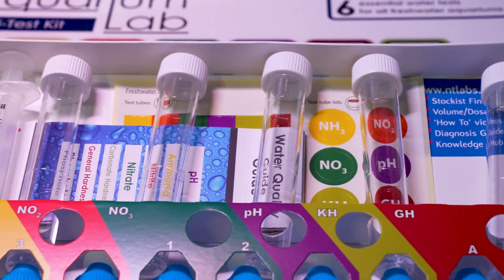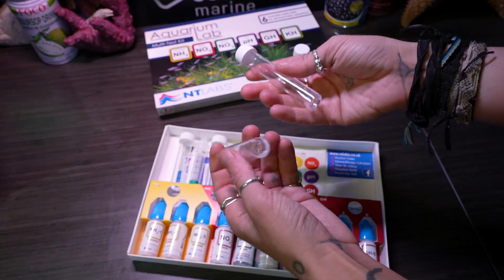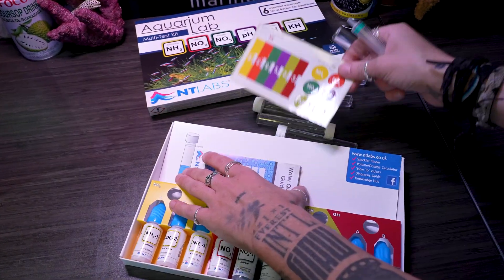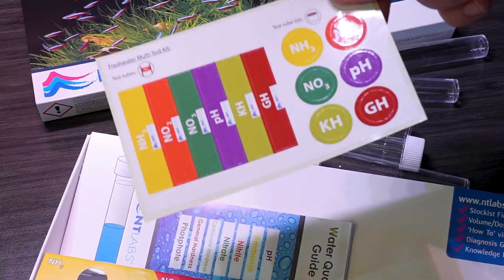Let's check out the test. Upon opening, you will see it has a pretty neat design. It includes test tubes, reagents, handy dandy stickers to make labeling easy, and instructions that walk you through what every test is.